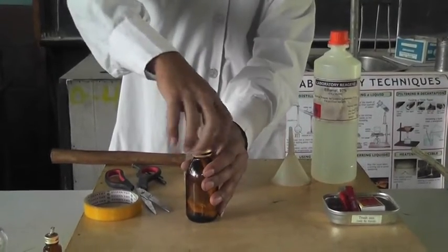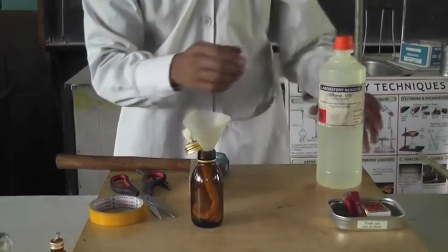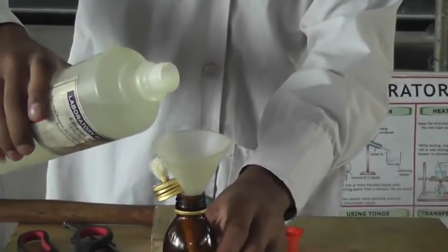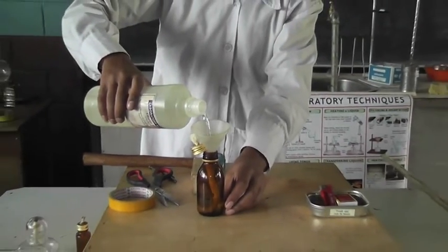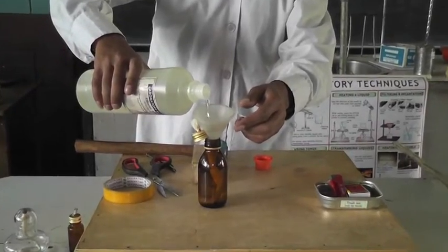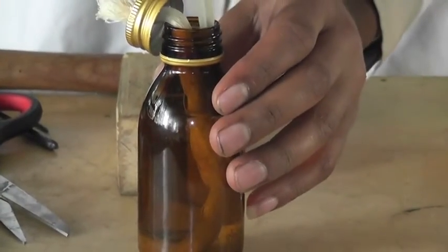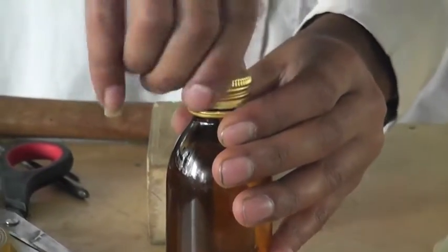After that, we add alcohol. This is the alcohol. We add alcohol — more than half of the volume of the bottle. Now it is ready for use.